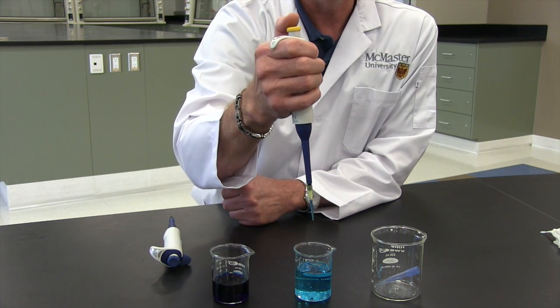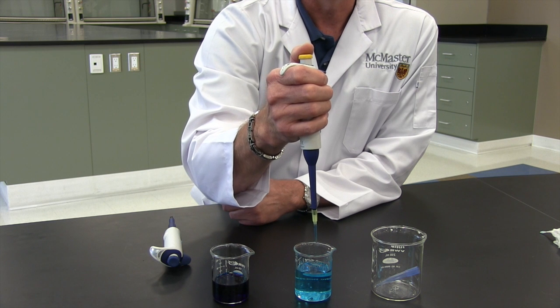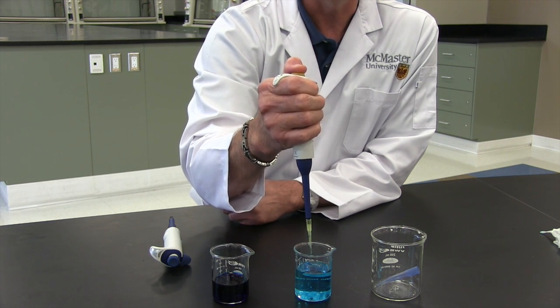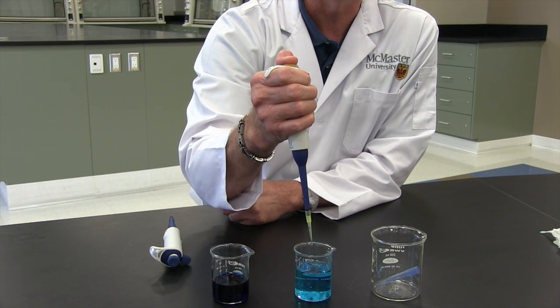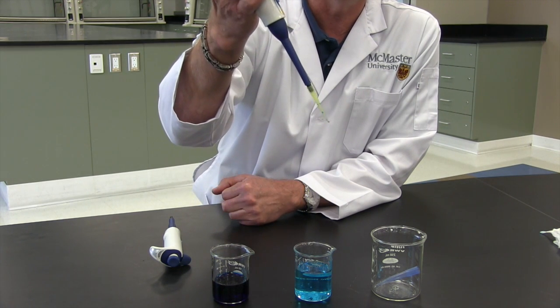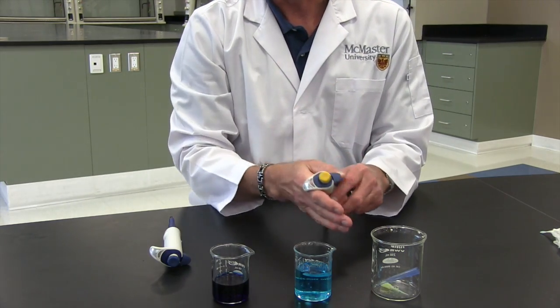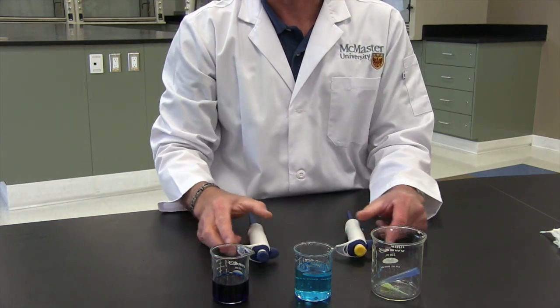This causes another error in that it's more than what you need, and also when you go to dispense it, it's harder to get it out because you don't have that extra bit of volume to help get all of the liquid out of your tip. So those are just a few of the errors that you should try to avoid.